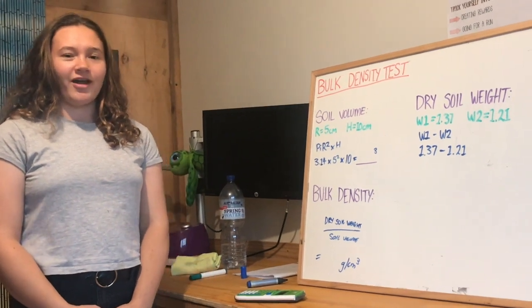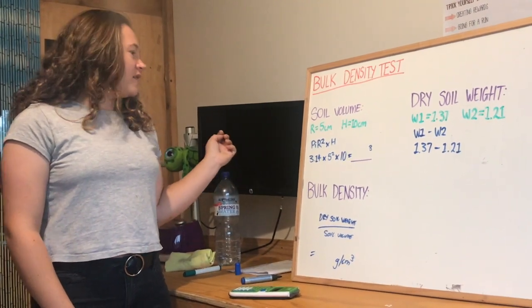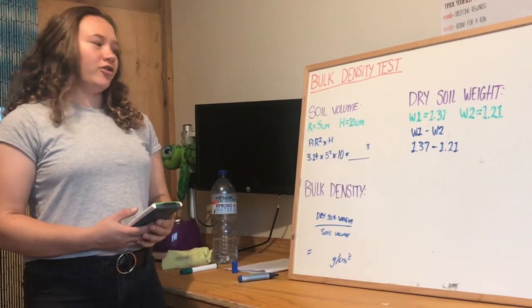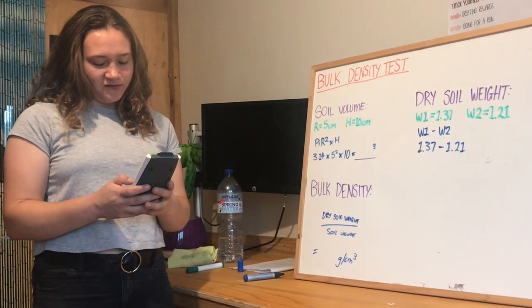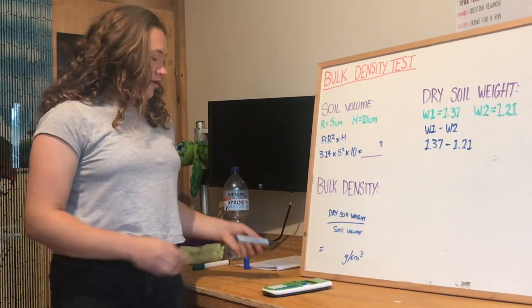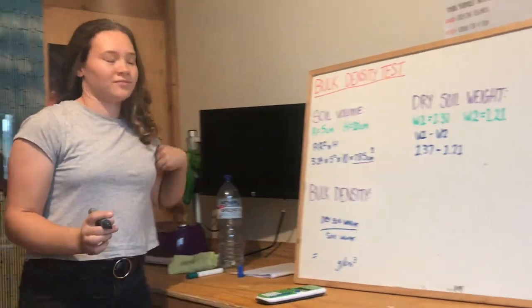We'll begin by calculating the overall volume of our sample. Using the PVC piping, we had a radius of 5 centimeters and a height of 10 centimeters. Therefore, to calculate the volume, we do pi r squared times height. In other words, 3.14 times 25 times 10. On our calculators, that comes up as 785 centimeters cubed.